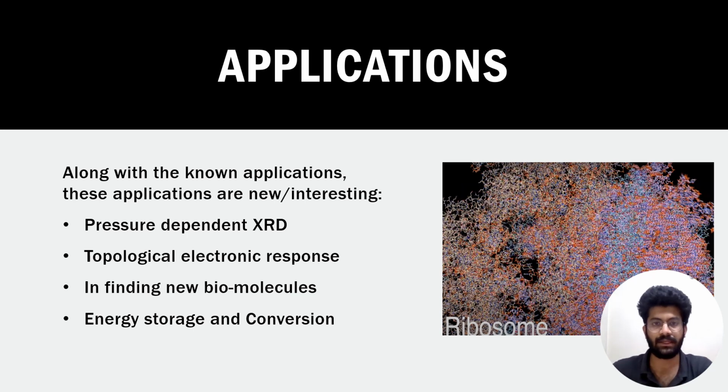Along with the known applications, I found that pressure-dependent XRD experiments are really interesting, as changing the pressure changes the crystal parameters, and we can expect some changes in the fundamental behavior as well. Along with some interesting physics phenomena and biomolecule discoveries, it can also be used to develop new energy storage solutions by helping in development of such structures which can hold the energy for long without leakage or charge quickly.